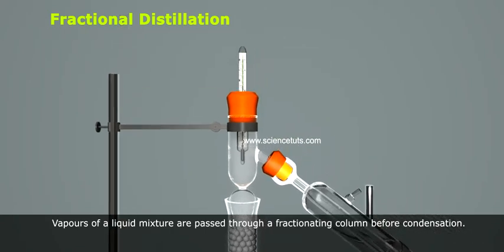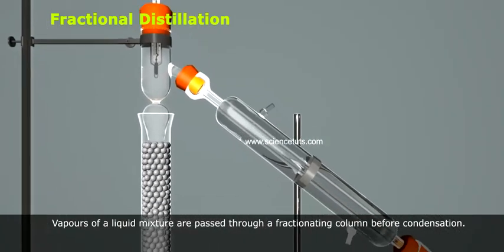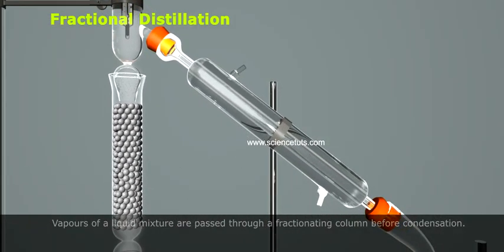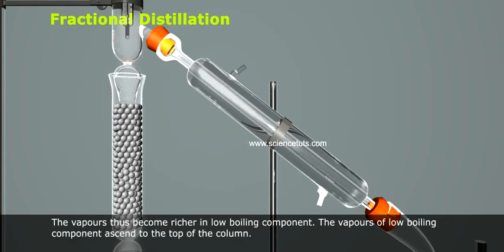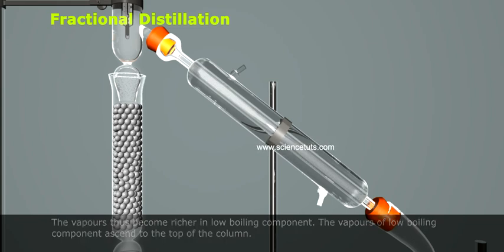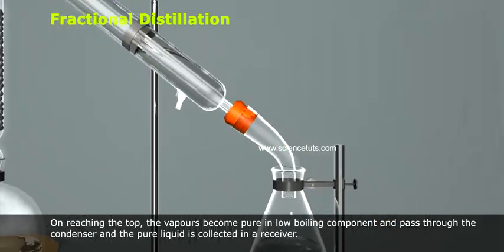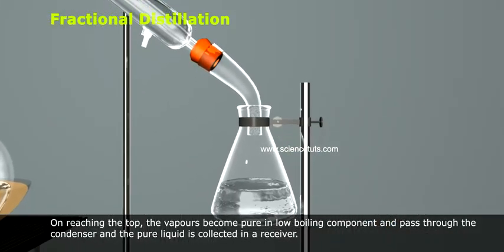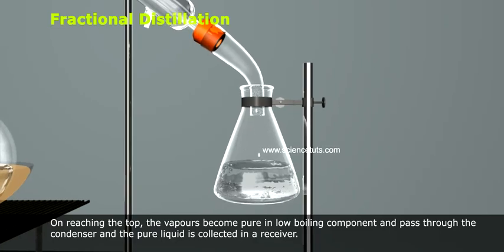Vapors of a liquid mixture are passed through a fractionating column before condensation. The vapors thus become richer in low boiling component. The vapors of low boiling component ascend to the top of the column. On reaching the top, the vapors become pure in low boiling component and pass through the condenser and the pure liquid is collected in a receiver.